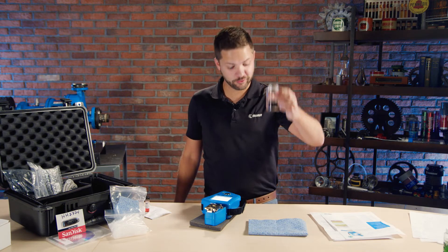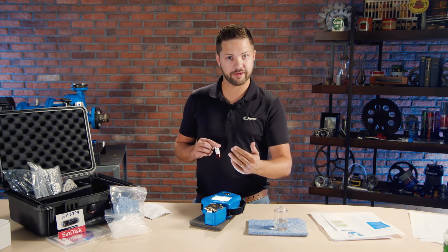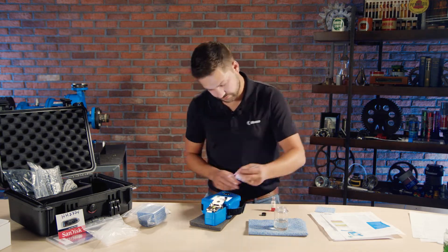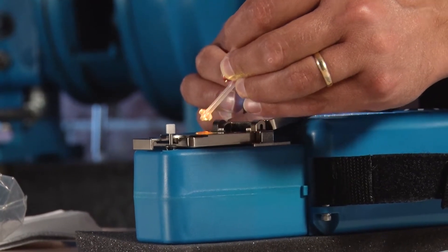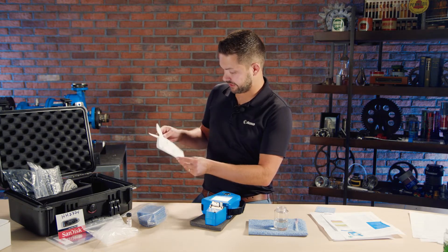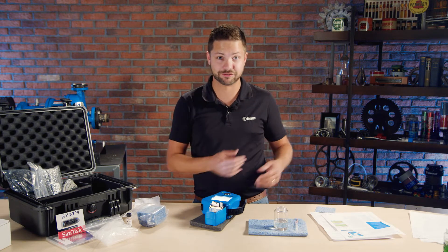I got an oil here and I'm about to test it. But as I was getting started, I realized one of the steps was simply to use the check fluid they provided to do a bit of a reference check to make sure everything's looking correct. As I'm waiting for it to finish — it's right at 35% — I'm looking at the reference fluid here. They provide a certificate of analysis for the infrared check fluid. And now it's 50% done. Like I said, it takes a couple of minutes — it's going to be the same time for the actual fluid.